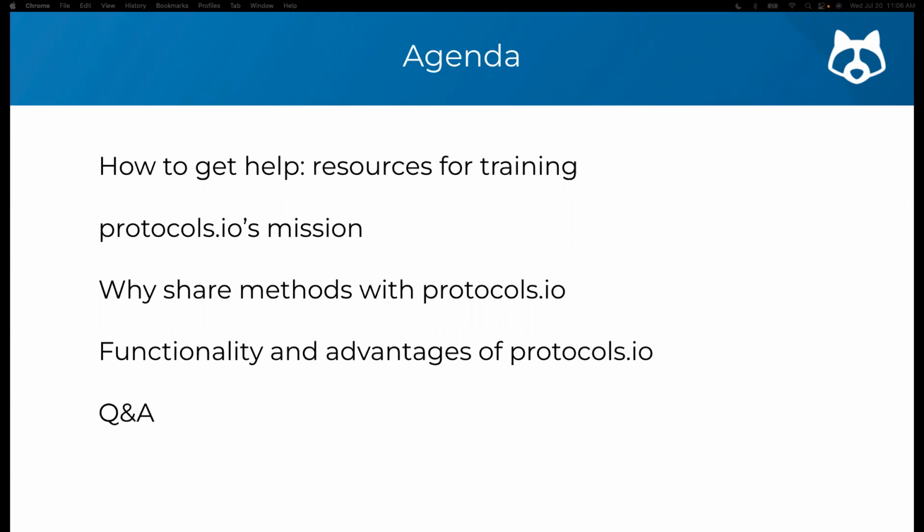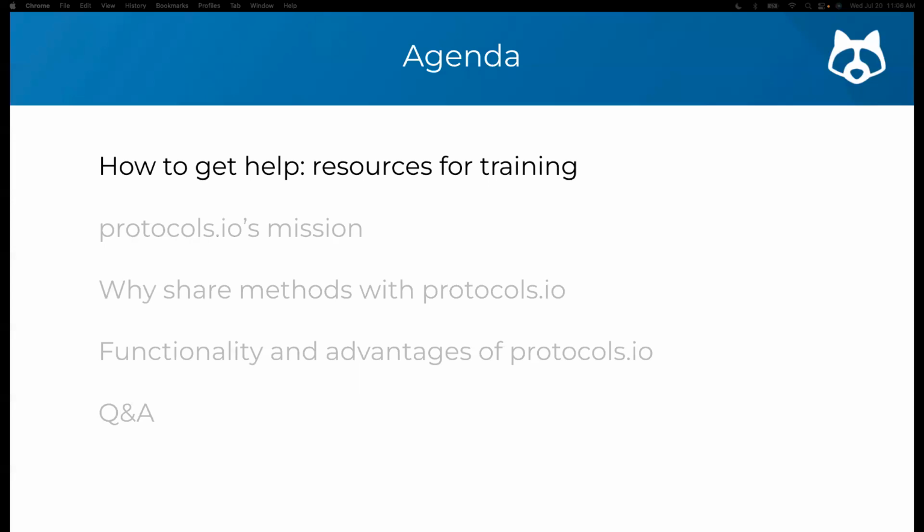Although I will share a lot of information today, we will not have opportunity to go over all the details of the different functions and tools. For that reason, I will share now some of the resources that you can browse for more information. First of all, we have these live streaming webinars. We run different webinars covering diverse topics. Some of them are tailored for new users, and some of them for more experienced users.